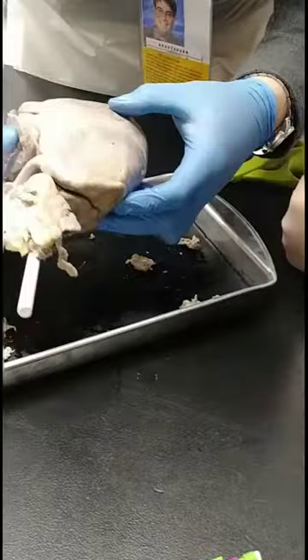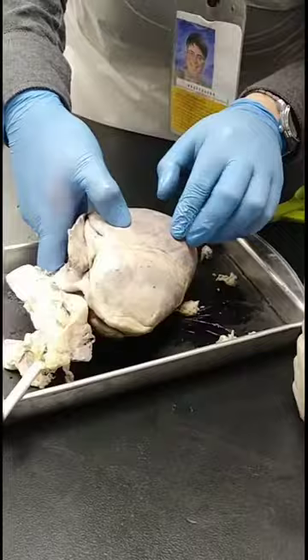What side of the heart is this? This is your front side again, or left side. And you're right, exactly. It's the left atrium, and it'll go down into the left ventricle.